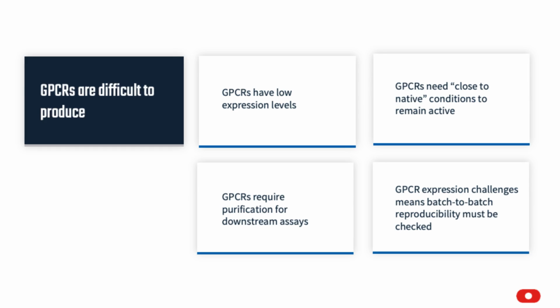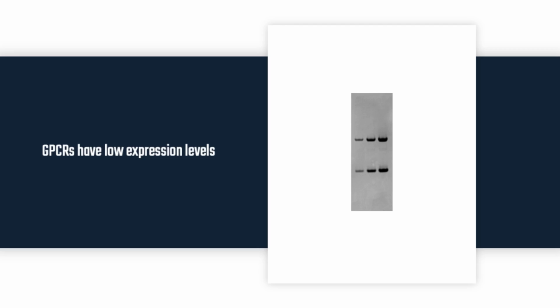The main reason why GPCR are complicated to produce, and most of you are most likely well aware of that and face a lot of struggle, is because they have low expression level in native cells. And while you can expect great expression level with secreted proteins, it is definitely not the case for GPCR membrane proteins. When producing them using recombinant technique, achieving high expression level is very complicated. And the result of that is that you often have to deal with and measure interaction with minimal sample amount, and therefore they are very precious. And for sure, it is then very important to have suitable technologies that will maintain their integrity, as we discussed previously, but also that will consume a minor amount of your protein. Typical ITC methods, isothermal calorimetry methods, have the great advantage of measuring interaction in solution, but they will consume a large amount of sample.